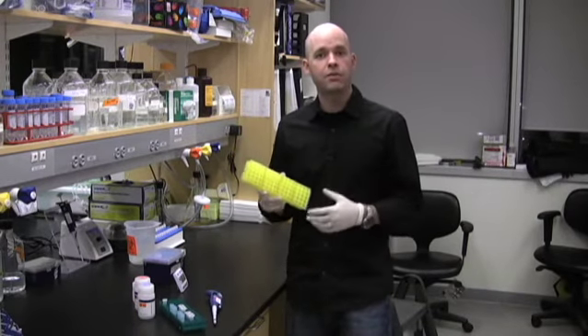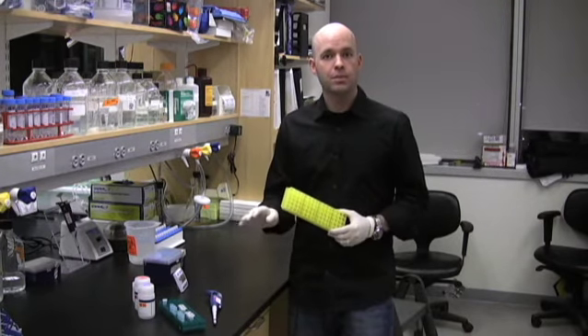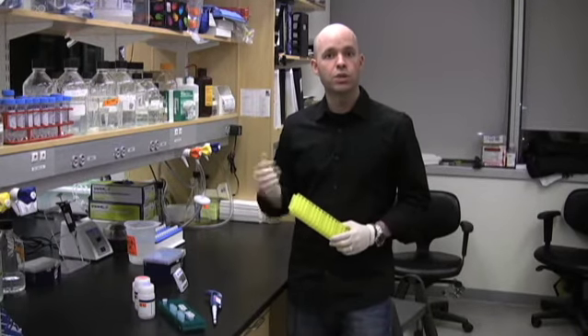To test the idea that this tip will get us to a re-dissolved bacterial pellet much quicker, we're going to compare how long it takes to do three mini preps using this resuspension tip versus the traditional way of pipetting each one.